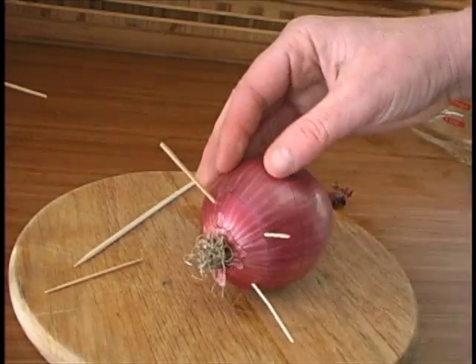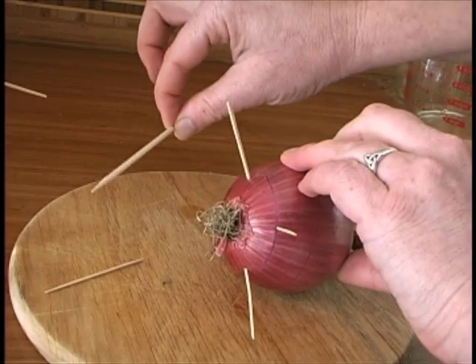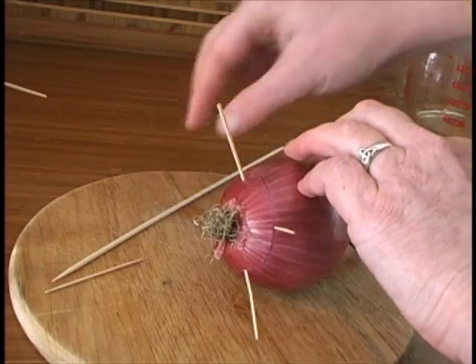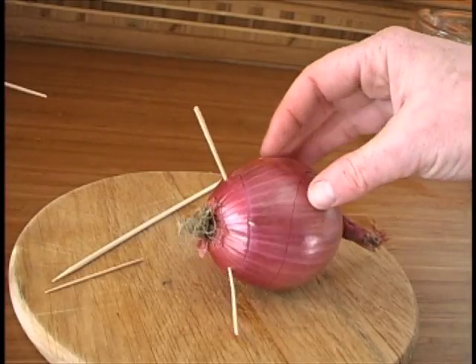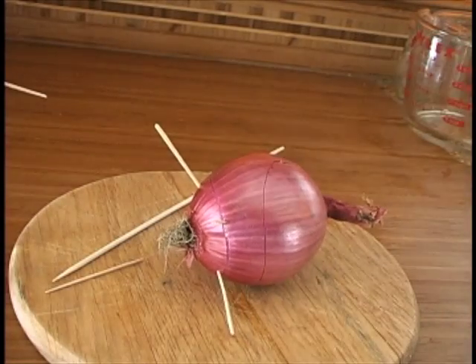You just don't want too much of the onion to be submerged. If you don't have any toothpicks, you could also use bamboo skewers that people use for kebabs when they barbecue. Just cut them to length so they don't stick out and injure anyone in your household.